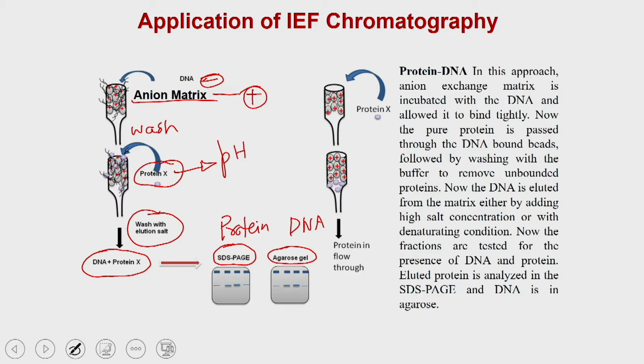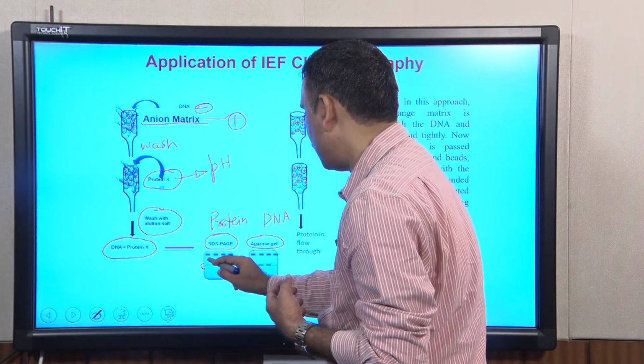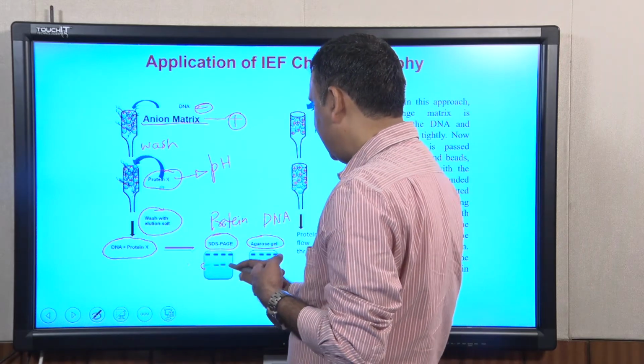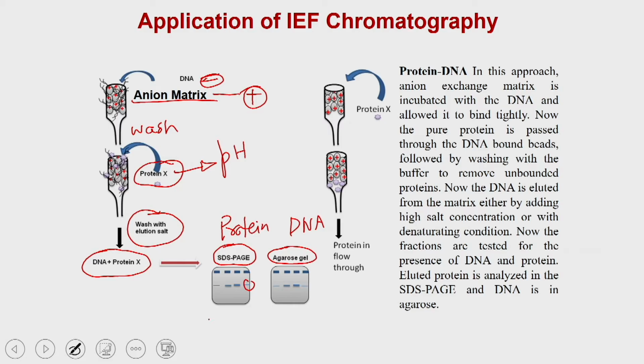When you analyze them, you will find a discrete pattern: you see a low concentration of protein, then the protein makes a peak, and then it goes down. If you plot this, the protein follows this pattern. If you follow the DNA on the agarose gel, you will see that the DNA is also following a similar kind of pattern.